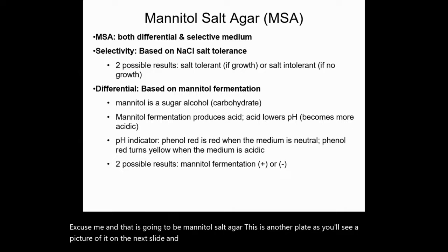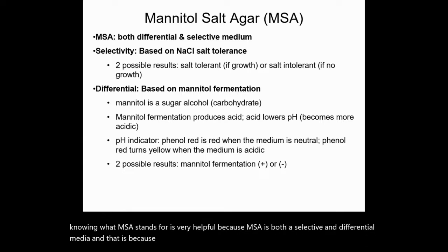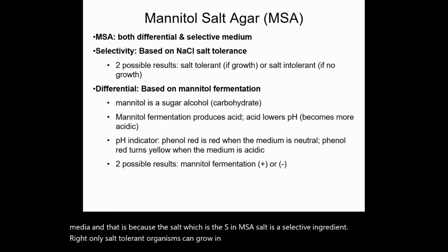And we call it MSA because it's just shorter and easier to say. But knowing what MSA stands for is very helpful because MSA is both a selective and differential media. And that is because the salt, which is the S in MSA, is a selective ingredient, right? Only salt-tolerant organisms can grow in the presence of salt, okay?